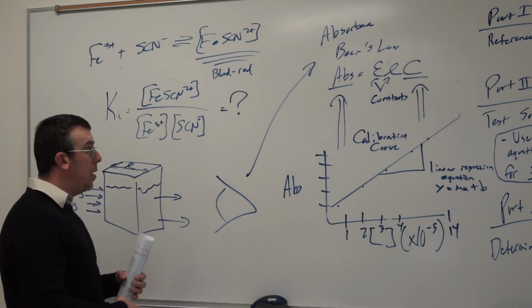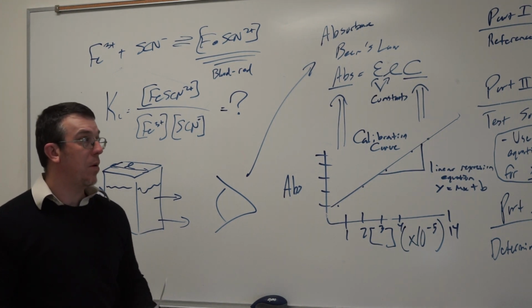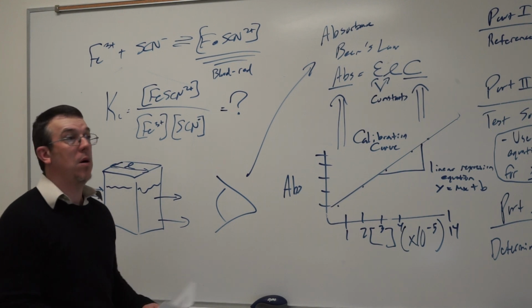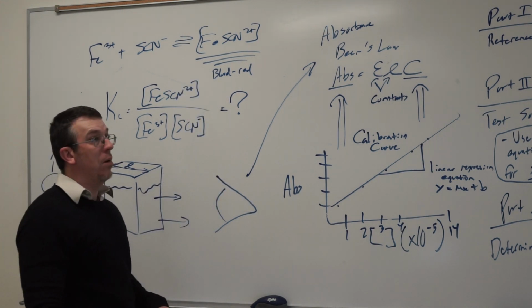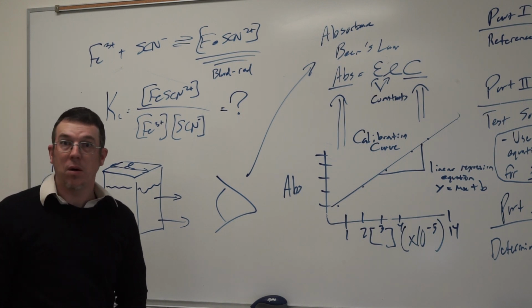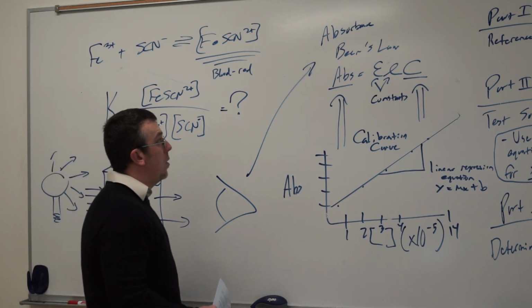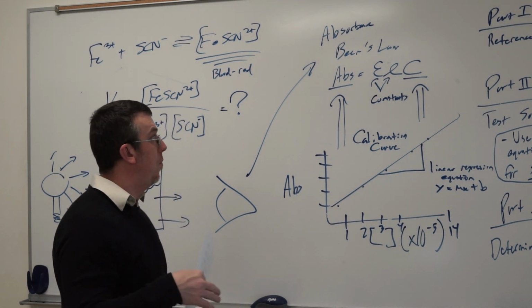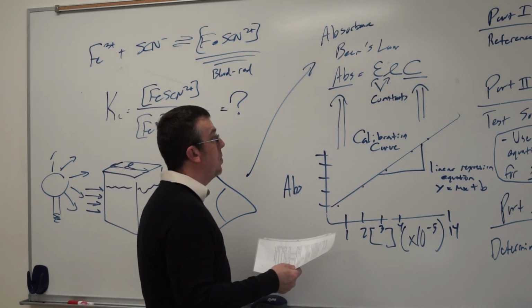Now, in our case, we're going to use a spectrometer, and the wavelength we're going to be focusing on is 450, and that's because of the color of this solution that it makes. Like I said, it forms a really dark red-brown color. Now, after we've gone through the process and the experiment, we've analyzed the samples with a spectrometer.